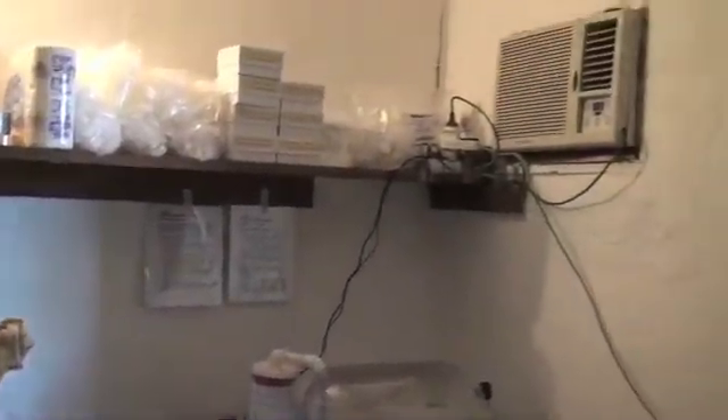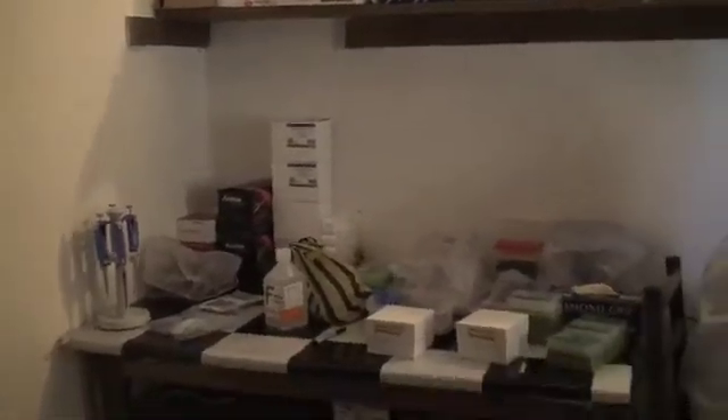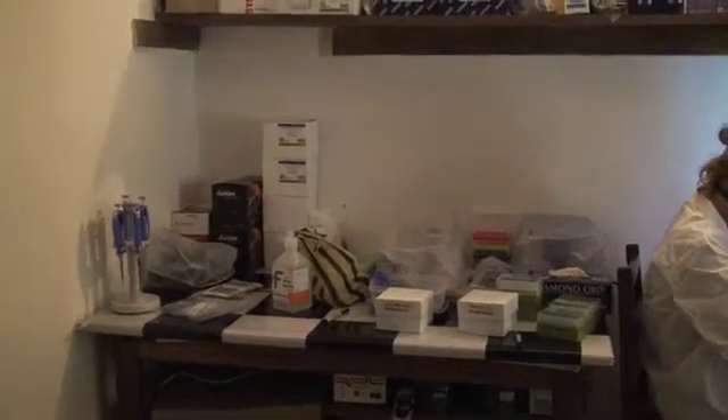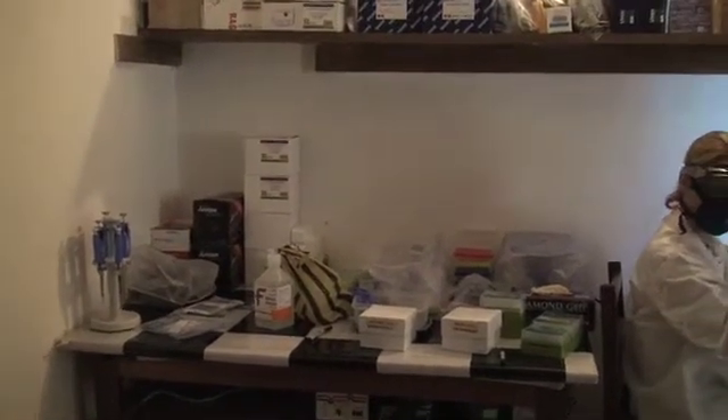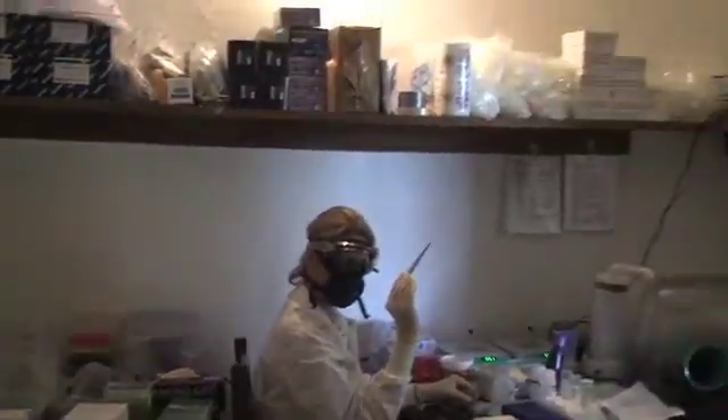And here we are in the lab. We have an air conditioner which comes on every 30 minutes for 30 minutes. We have one shelf of supplies. The lab bench over here on the left is where we will do PCR. All the equipment is currently covered in vinyl covers.